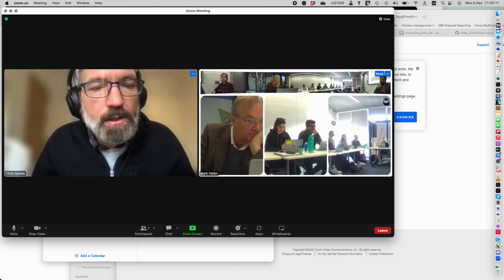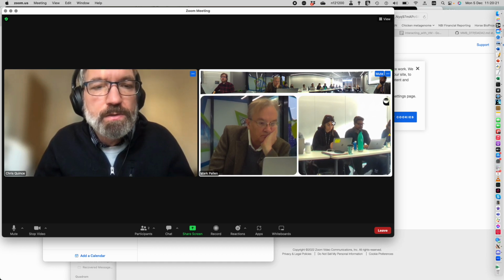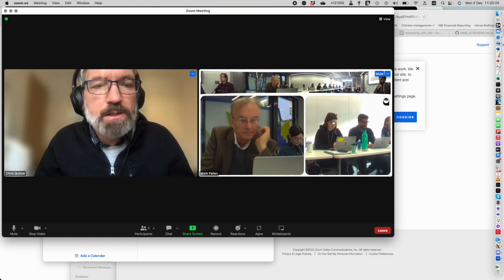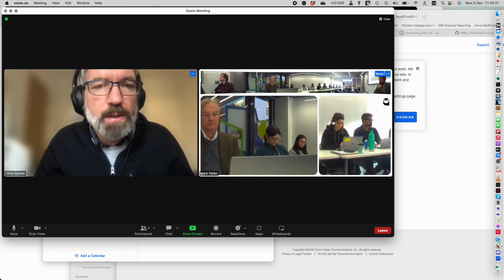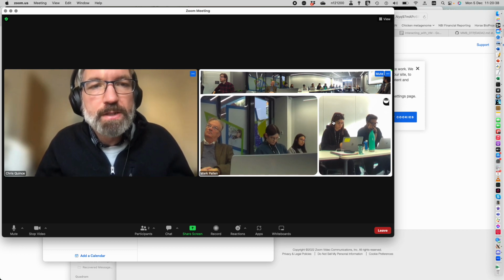Not quite. Actually, you group them together because under the concept of OTUs, they are the same OTU. So if we're imagining that we're trying to form OTUs at the species level, those two different sequences would correspond to different strains of the same species. So if we want to profile species, we should group them together.